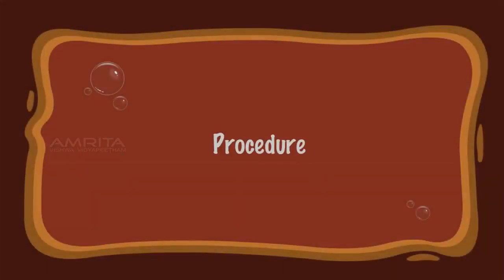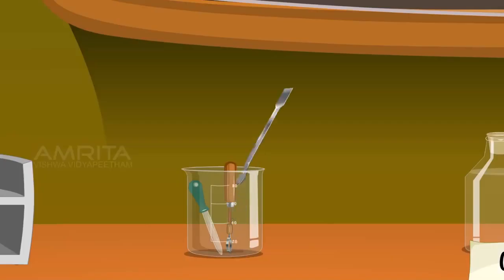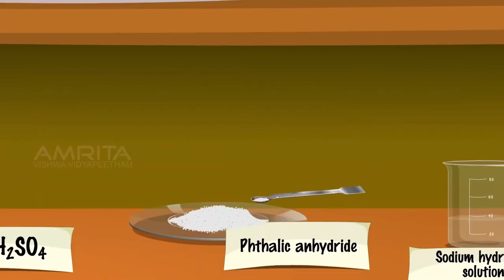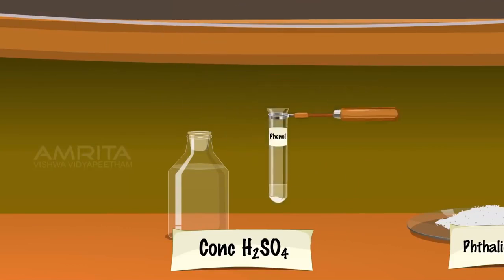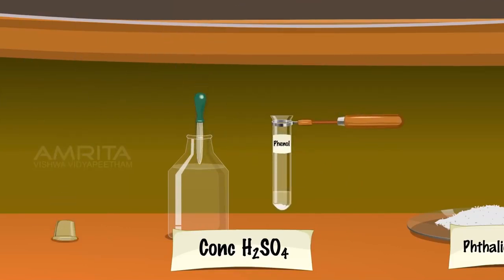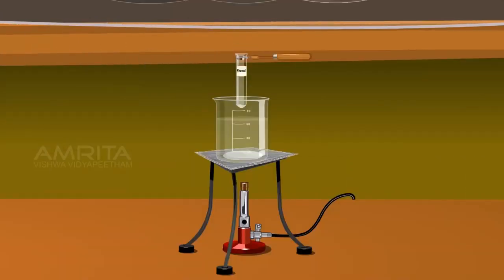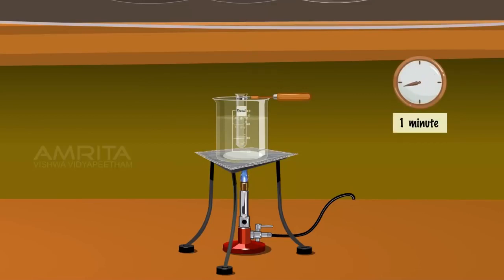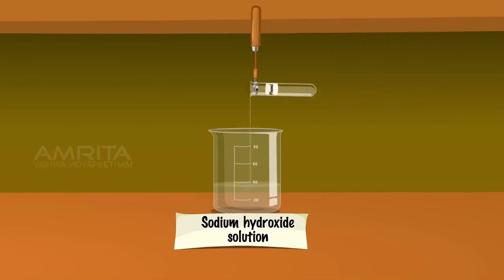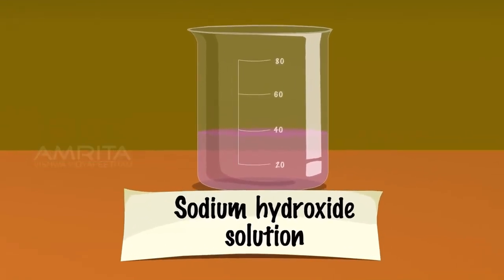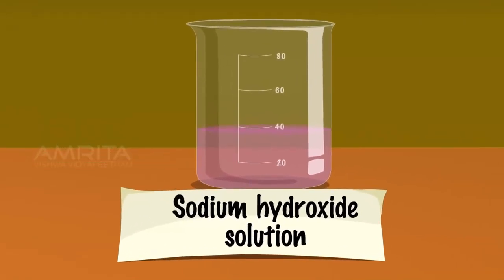Phthalein dye test. Procedure: Take a small quantity of phenol in a test tube. Using a spatula, take a small quantity of phthalic anhydride and add it into the test tube containing phenol. Using a dropper, add a small quantity of concentrated sulphuric acid. Heat the contents in an oil bath for about 1 minute. Pour the reaction mixture carefully into a beaker containing sodium hydroxide solution. On heating, phenol reacts with phthalic anhydride in the presence of sulphuric acid to produce phenolphthalein, which is colourless. Phenolphthalein gives a pink colour with an alkali such as NaOH.